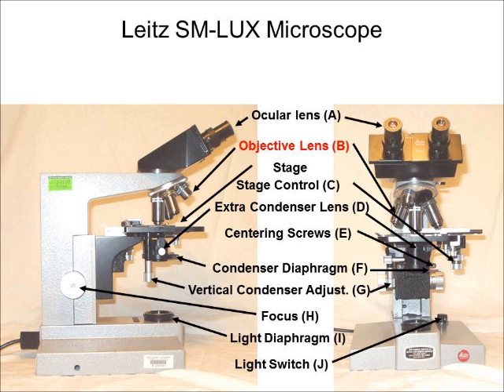Next we have the objective lenses which, as you might guess, are the lenses that are next to the object that you are viewing. For these microscopes the four objective lenses have magnifications of 4x, 10x, 40x, and 100x. This last lens requires oil immersion. The final magnification is going to be 10 times these values when you include the 10x ocular lenses.